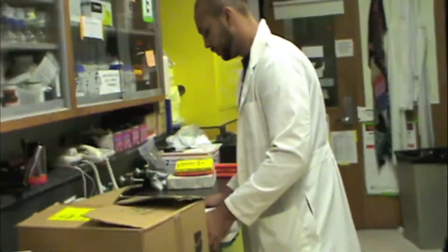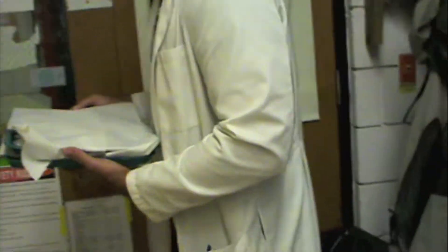Martin and I just finished all the weighing and analysis and we're going to take the soil samples to the furnace. You got it Martin? You got both of them? Alright, let me get the door for you.